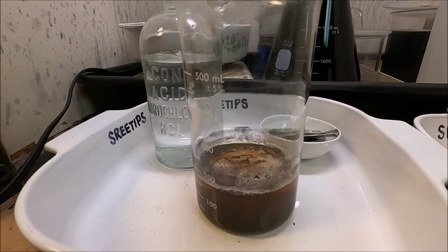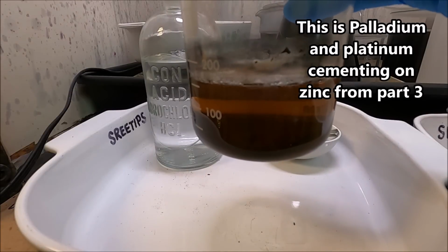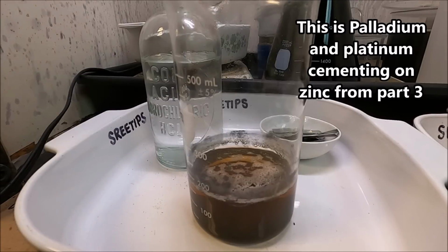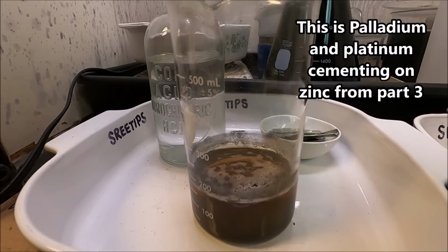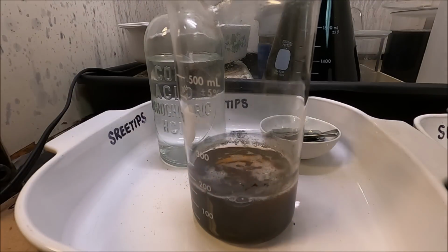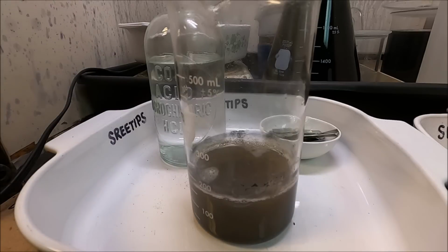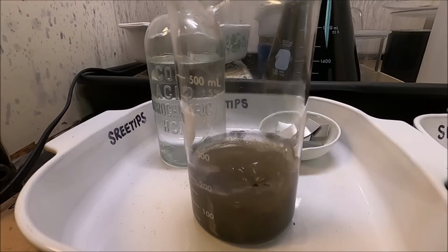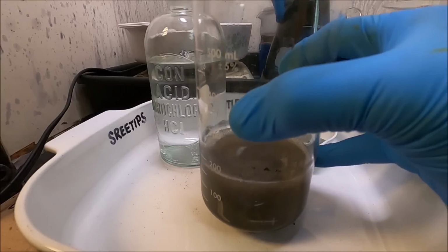First thing we're going to do is, you can see some of this metal has come back out of solution, and I'm making that determination by the color that I'm seeing there. So I'm going to add a little bit of hydrochloric acid, maybe about 6 milliliters. And what we'll do then is put in some more pieces of zinc to get the rest of that to come out of solution. Then I'm going to set it back here out of the way.